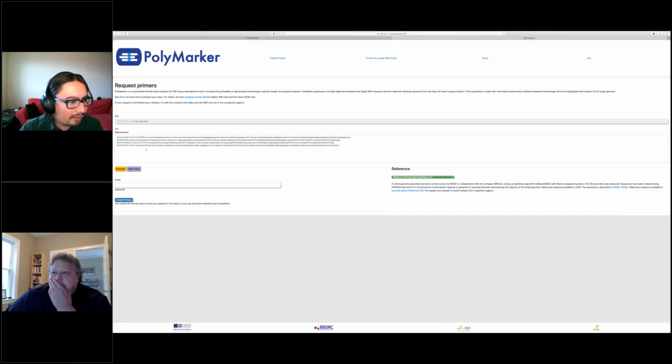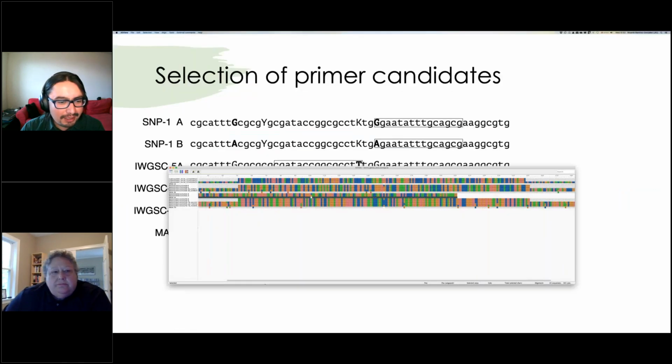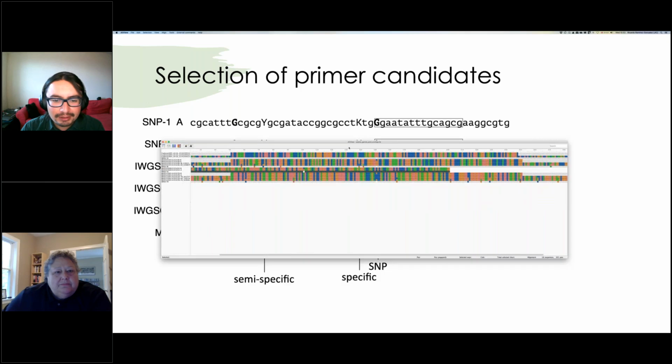it gives you these examples that I just ran. So you can copy and paste it to get an idea. So we just had a question regarding what you were doing. What was the alignment viewer that you just used to view the downloaded file? This one, it's called AliView. AliView, it's here. Okay. All right.